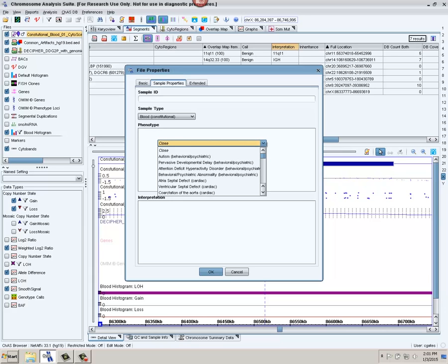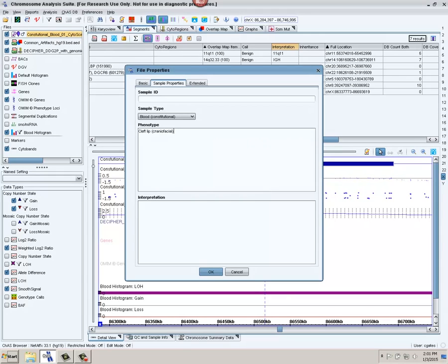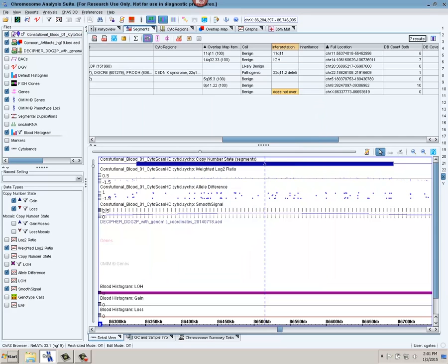And now I can add some sample level annotation to it. So I'm going to show that this was a blood sample. I can right-click in here to choose from a list of various phenotypes, or I can free type in a particular phenotype. My interpretation in this case is going to be, again, it's free text, so you can type in anything you want. I'm going to type in that it was a 22q11.2 deletion. Say okay. And now, by using my cytoregions and my overlap map, as well as the segments that I have in my database, I have quickly gone through and assigned some sort of call, whether it be benign or pathogenic, to each one of my segments, as well as an overall sample interpretation.